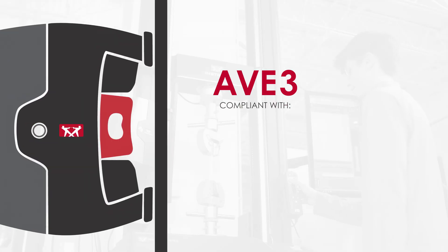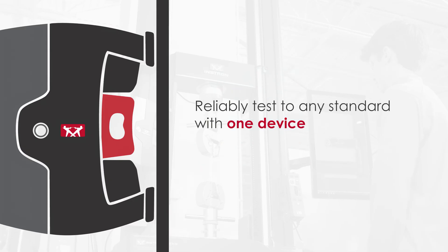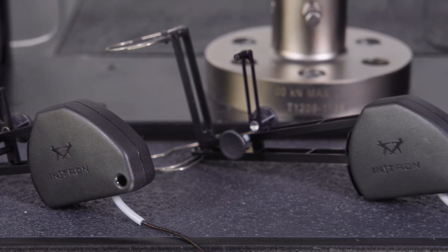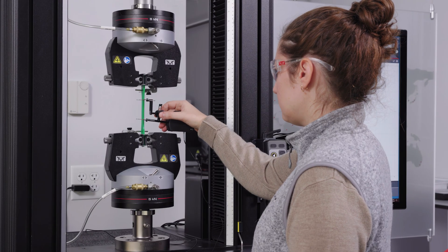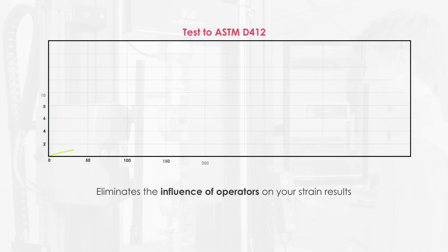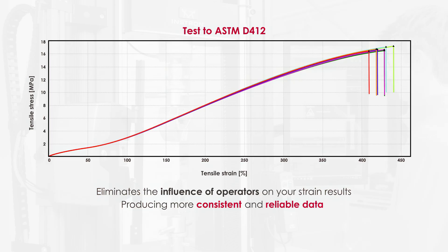The AVE-3's compliance with ISO 9513 and ASTM-E83 means you can reliably test to any standard with one device, eliminating the need to purchase and maintain multiple clip-on devices. And unlike manual contacting extensometers, the AVE-3 eliminates the influence of operators on your strain results, producing more consistent and reliable data.